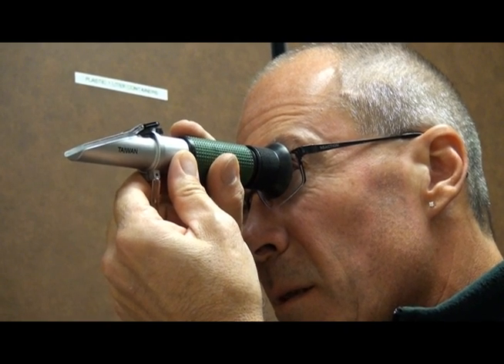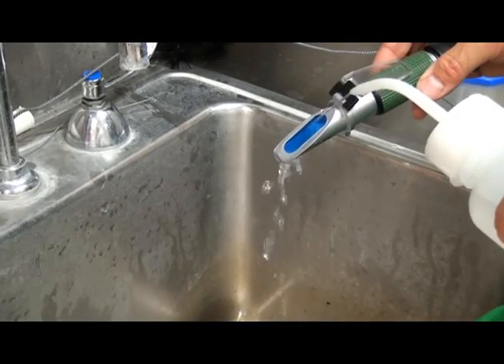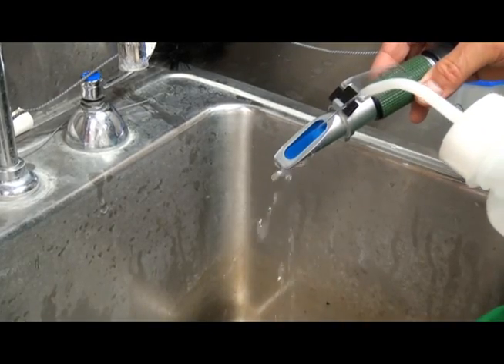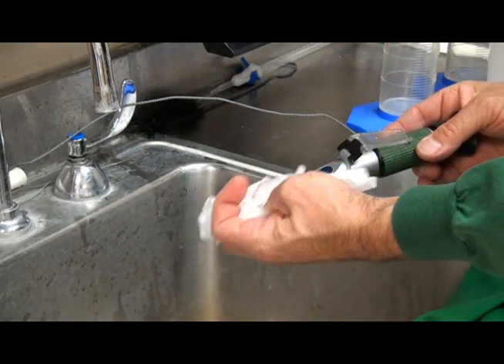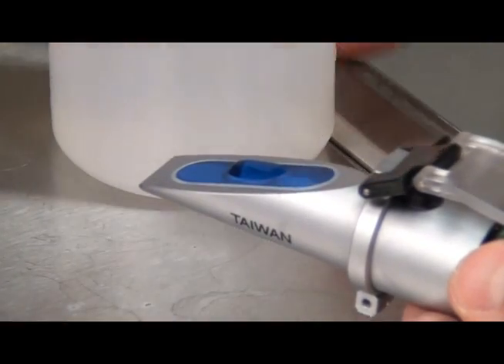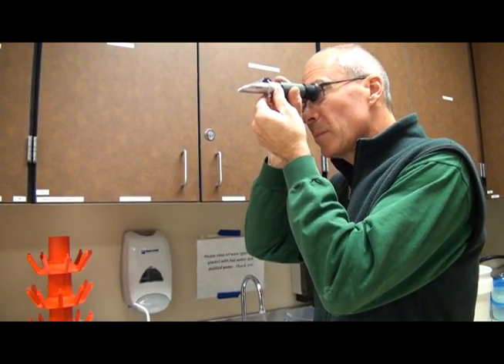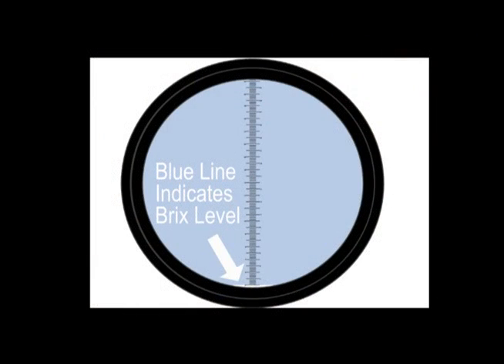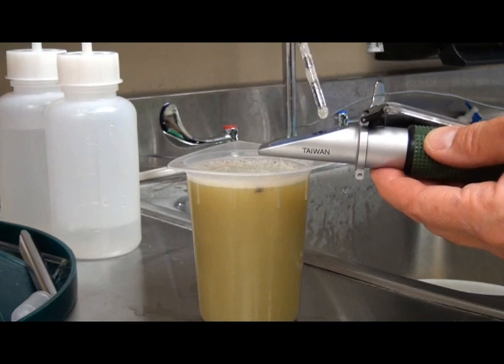In preparation for testing juice with a refractometer, it is good practice to verify the calibration of the device using DI water. First, clean the refractive lens prism with DI water. Place a sample of the DI water onto the prism and observe the sample measurement in the viewfinder. Verify the sample measurement is 0.0. Then wipe the prism surface dry with a chemwipe. The refractometer is now ready for sampling.